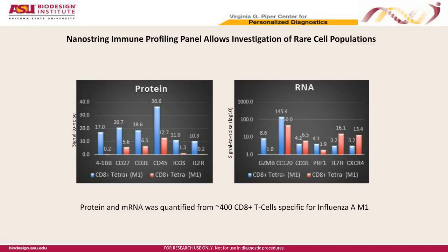And currently we are looking at the differences between different types of antigen-specific T cells, in particular influenza versus chronic viruses such as CMV or EBV within human populations, and then ultimately more tumor-specific, chronically antigenically stimulated T cell populations. And I think that tools such as these provide the opportunity to do that on a more rapid, integrated platform system, to be able to look in particular at protein and RNA simultaneously within small numbers of T cells.